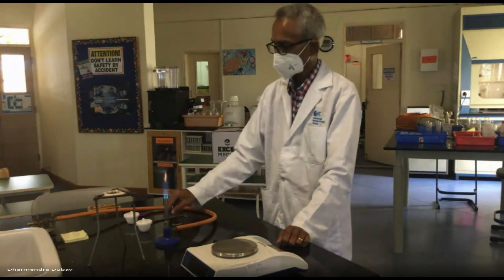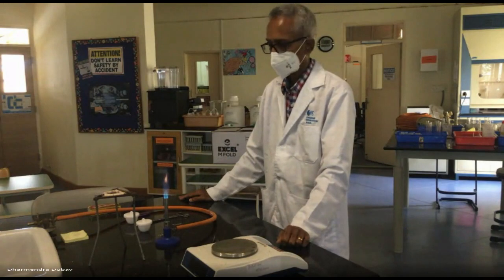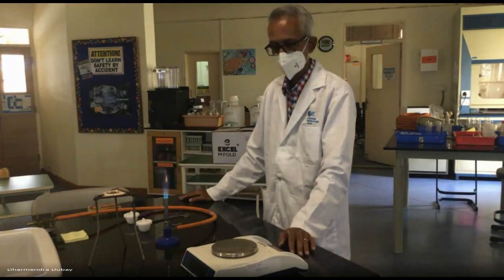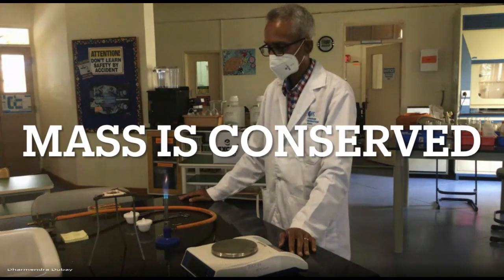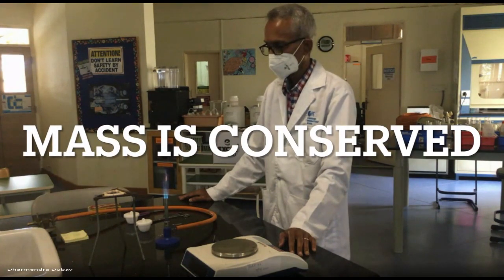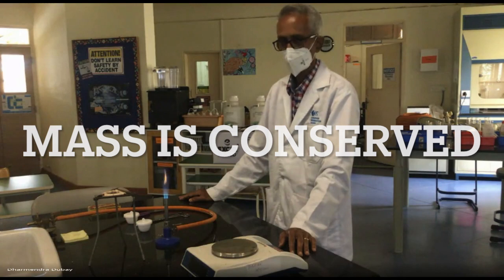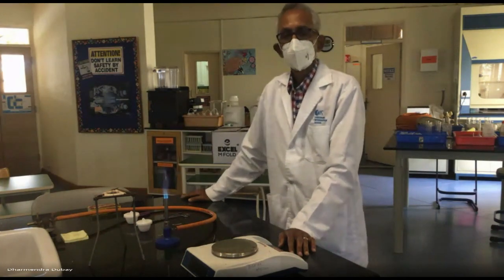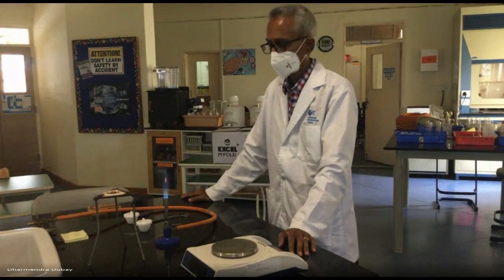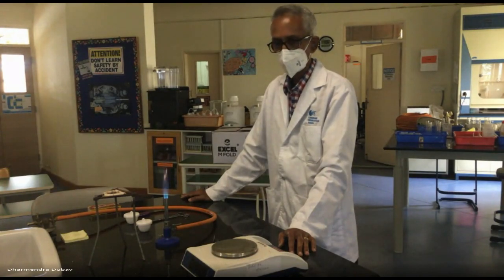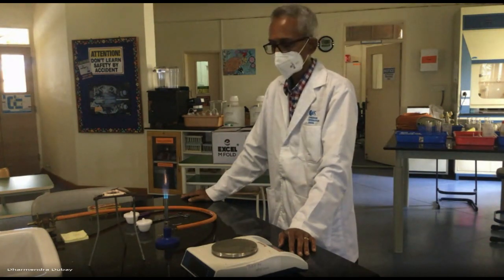It is reacting with oxygen. And when it is finished reacting, then what do we have? All of the magnesium that was there shouldn't have gone anywhere. It should have all reacted with the oxygen it needs to form magnesium oxide. Whatever magnesium was in the ribbon is still there in the oxide, but now it is the magnesium plus the oxygen. Thanks for sharing that response, Priya. I am sure a lot of people felt the same.